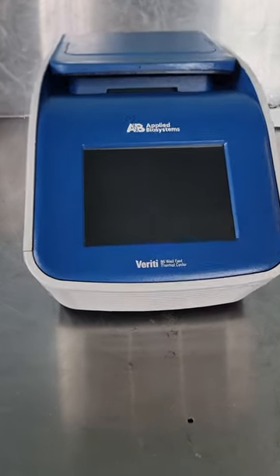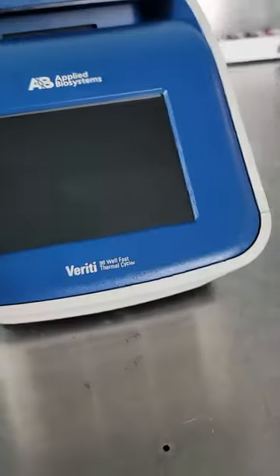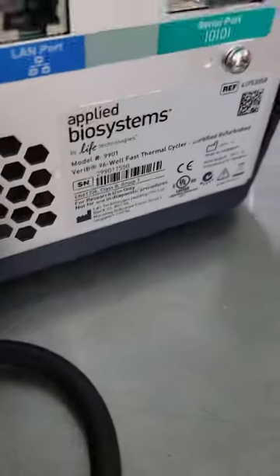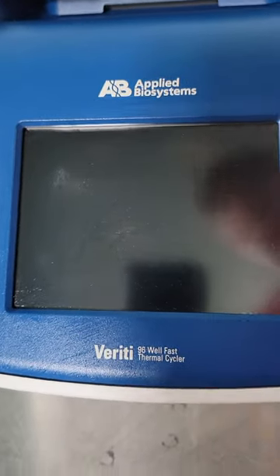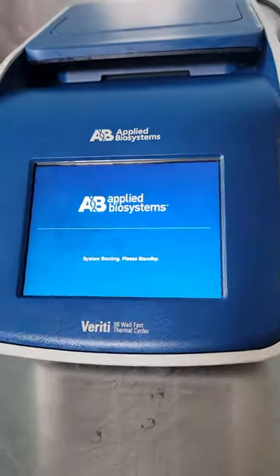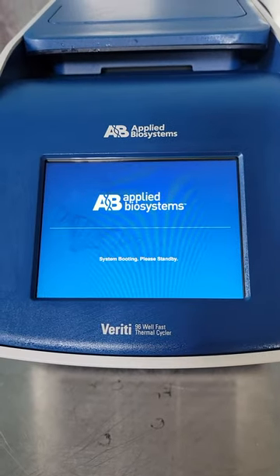Here we have an Applied Biosystems VeriFi 96-well fast thermocycler. It looks really nice, but we don't know how to get this thing to work. When you power it up, as you can see, it does start and it starts to boot.